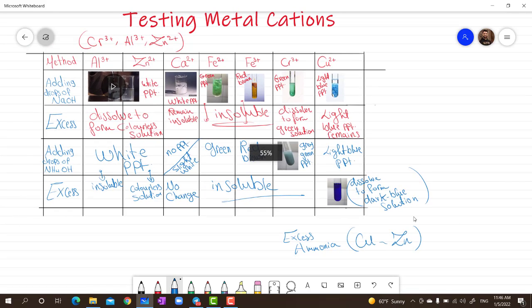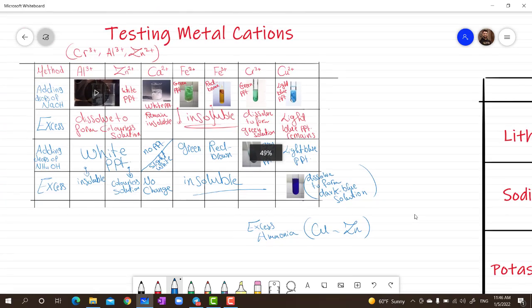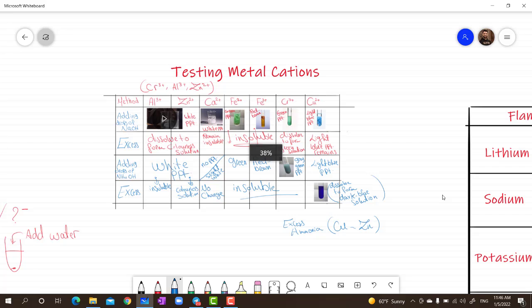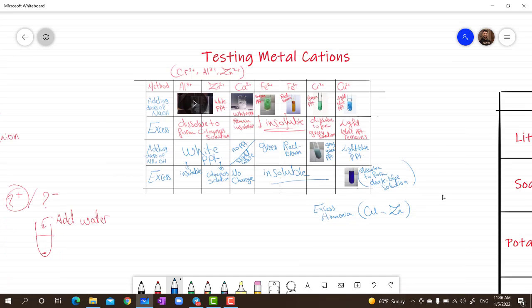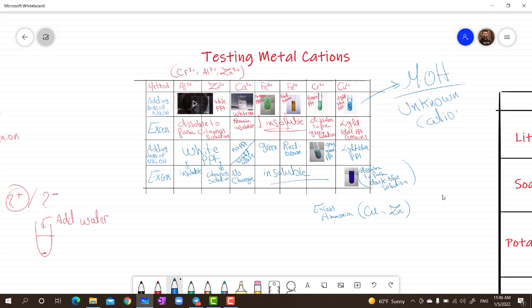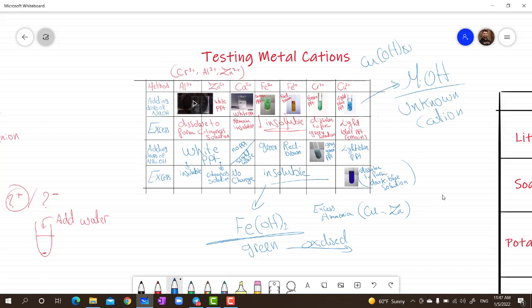Some cations cannot be tested using these procedures because their hydroxides are soluble in water. The precipitates we observed are in fact the metal hydroxides of the unknown cation — for example, the light blue precipitate of copper is copper hydroxide, and the green precipitate of iron is iron 2+ hydroxide. It is important to note that iron 2+ hydroxide (green), if left for some minutes, will be oxidized to iron 3+ hydroxide (red-brown), producing a color change from green to red-brown.